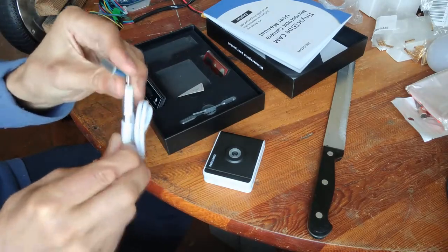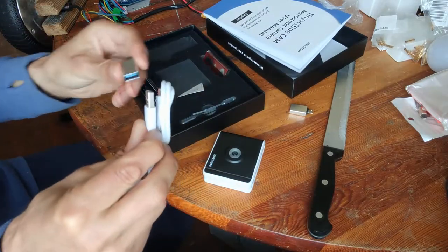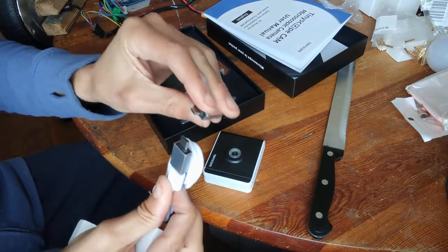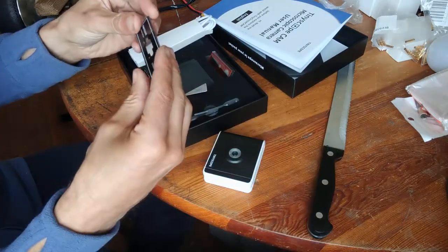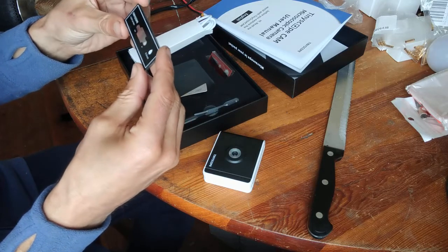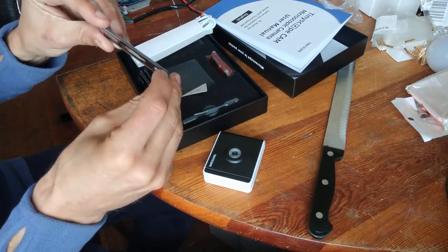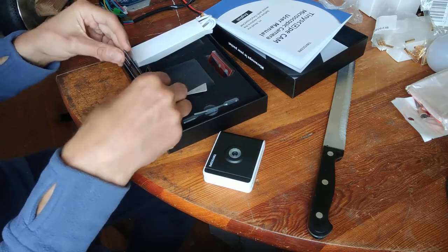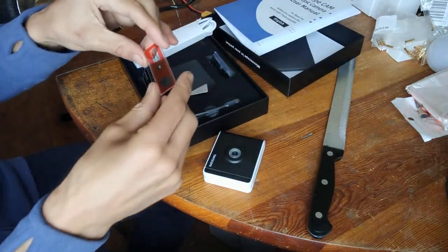USB-C to USB-C, so you can plug it into your computer. And this one goes into your smartphone. If you have an older smartphone with micro USB, there's an adapter for that too. Nice. There's also a liquid sampler — let's see if this can be removed. There should be a manual here.